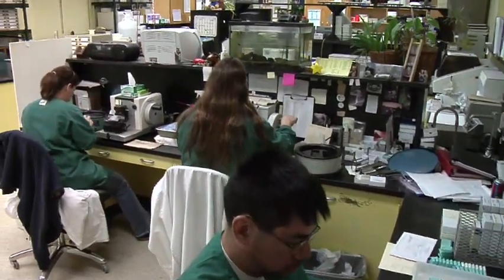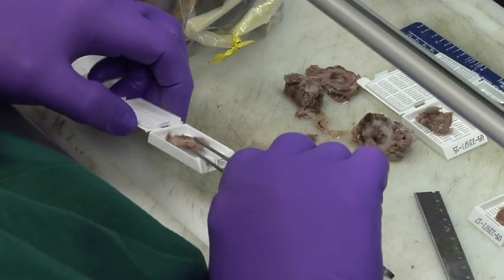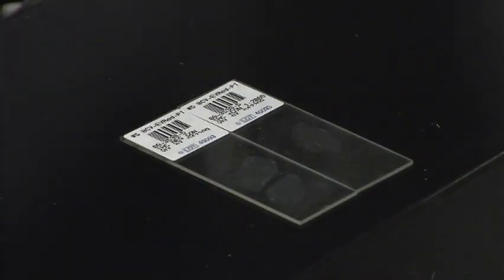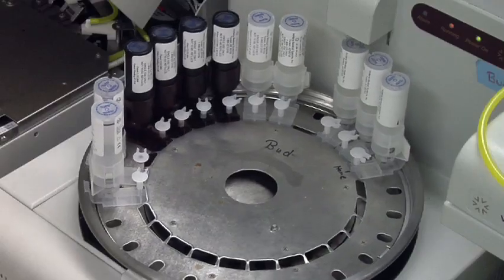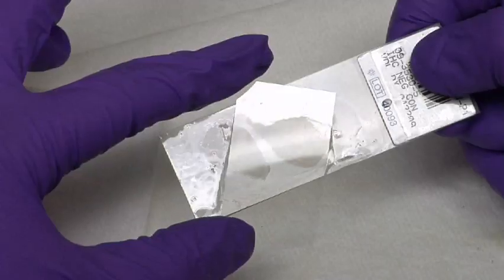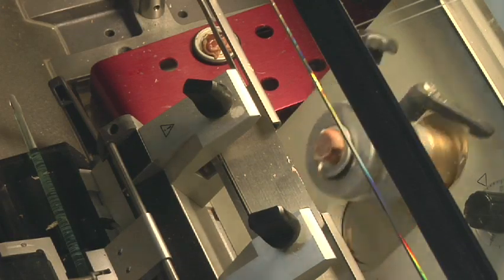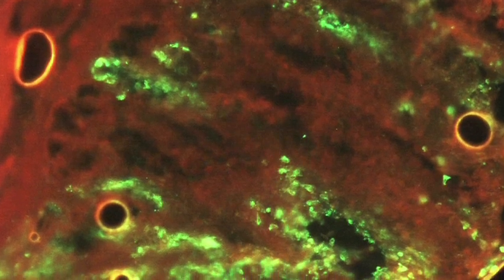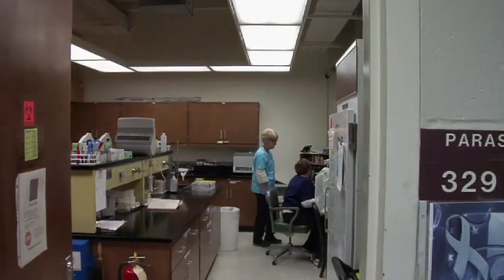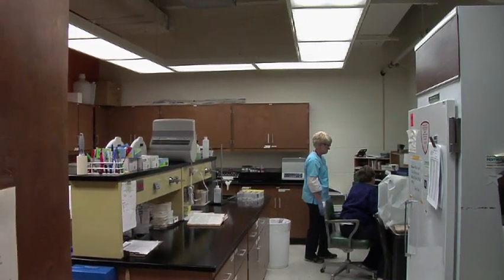Samples needing special preparation may be sent to the histopathology lab, where formalin-fixed tissues from biopsies are prepared for microscopic examination. Some samples may be processed in the immunohistochemistry lab, which uses antigen-antibody interactions and staining techniques to help identify microscopic changes. Other samples are sent to the fluorescent antibody lab, which detects specific antigens in fresh tissues with specially stained antibodies. The services of KSVDL's other labs may also be required for a correct diagnosis.